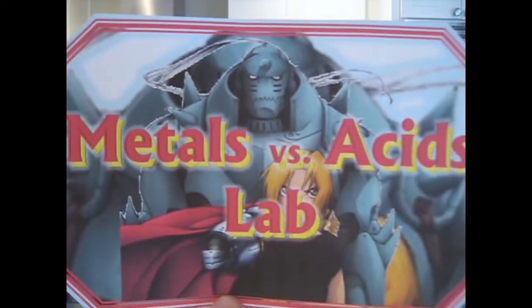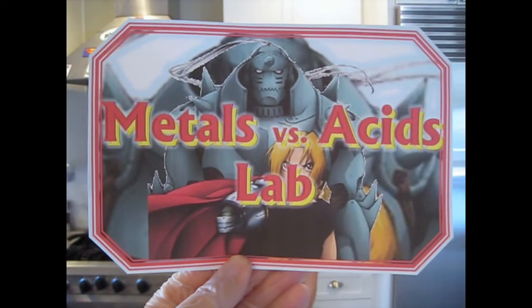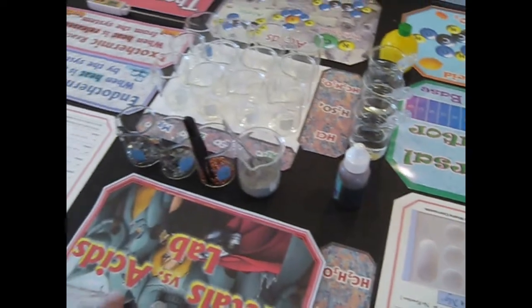The metals versus acids lab. Kind of a quick lab, and I'm not going to perform it. My big assistant is going to perform it. Say hi, Giovanna. Hi. Okay, so she is going to react a bunch of metals with a bunch of acids.